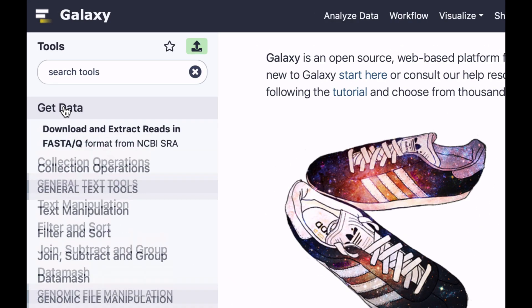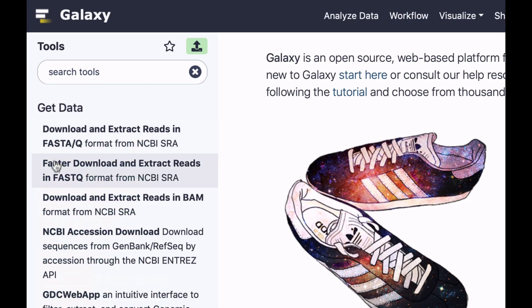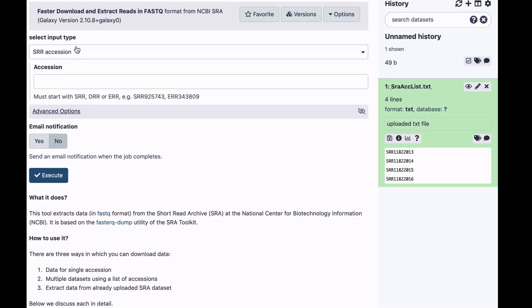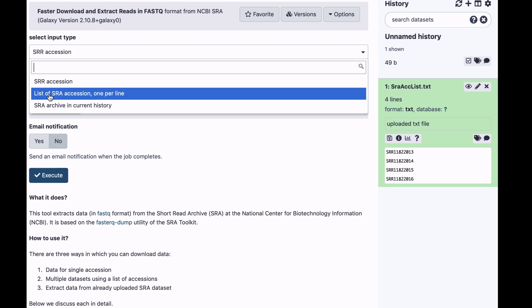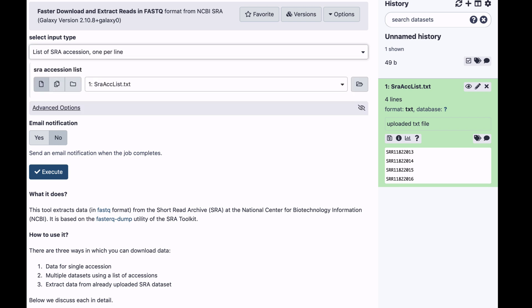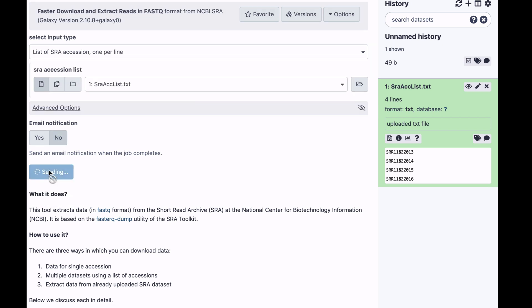Now we're going to go to Get Data. Select Faster than Load and Extract Reads. Here, because we're using File as an input, we're just going to select this option list of SRA accessions one per line. And click Execute.